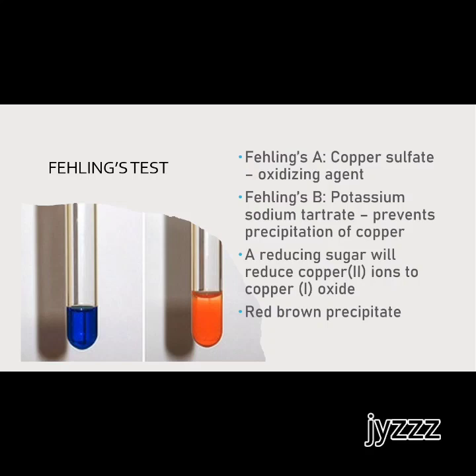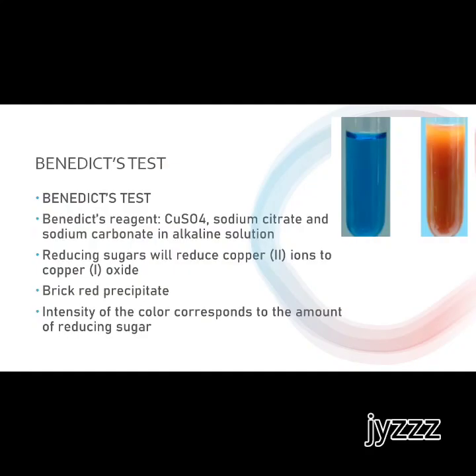Let's take a look at your Benedict's test. You have your Benedict's test here, and it uses your Benedict's reagent: your copper sulfate, sodium citrate, and sodium carbonate in an alkaline solution.